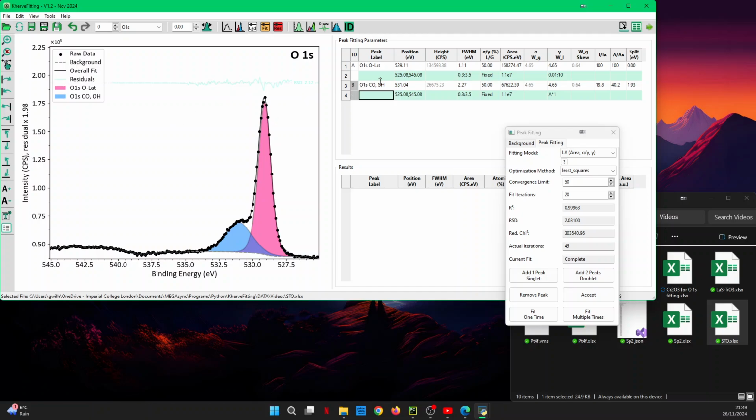This text is from Matplotlib, so you can really create anything that Matplotlib allows you to create. For example, if you had a pi star satellite, you just create something like this. Pi, you put it in between dollars, and that will become a pi. So everything that Matplotlib allows, this is also able to. Okay, so let's call it OH, and let's go into the next model.